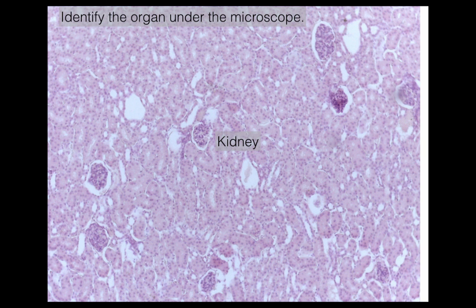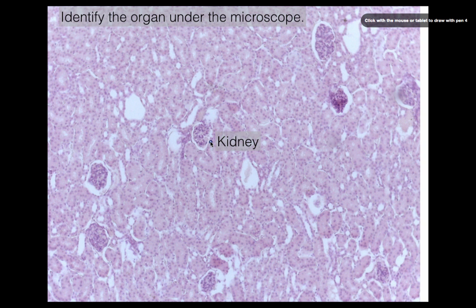We are back in the kidney, now in the kidney cortex — the outer part of the cortex, with the capsule on the very outside. The thing that tells you that you're in the kidney cortex are the renal corpuscles. You can see the nice white space separating the glomerulus, which is covered by podocytes — the visceral epithelium. You can also see a simple squamous layer on the outside, which is the parietal layer of the Bowman's capsule. All these circles are the proximal or distal convoluted tubules.